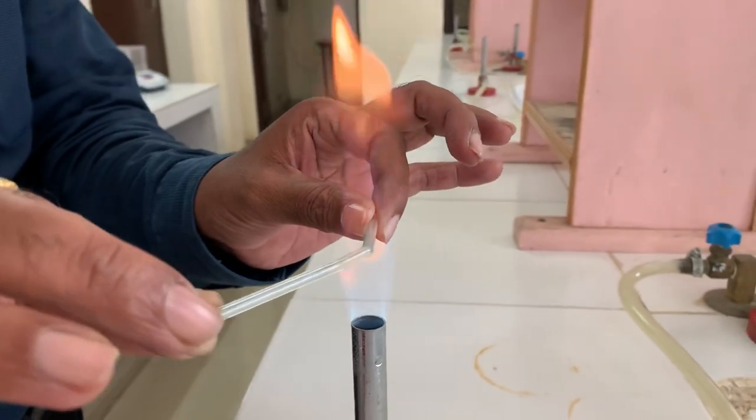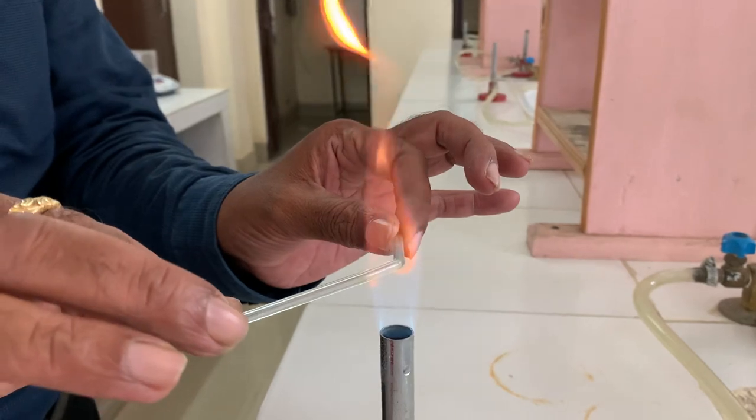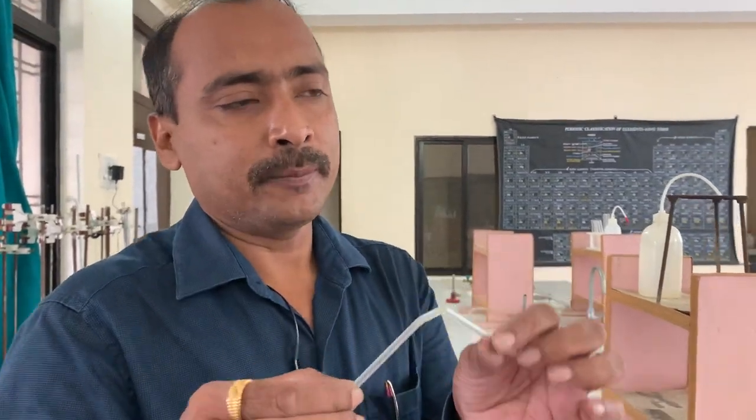You can see the tube is now bending. This bent tube is your delivery tube for air passing.